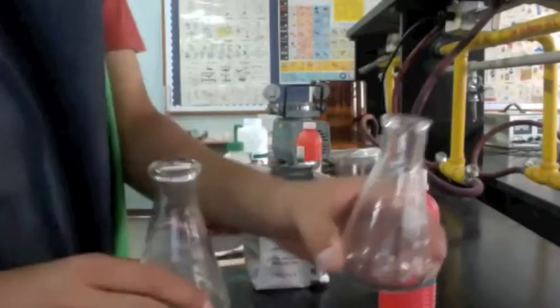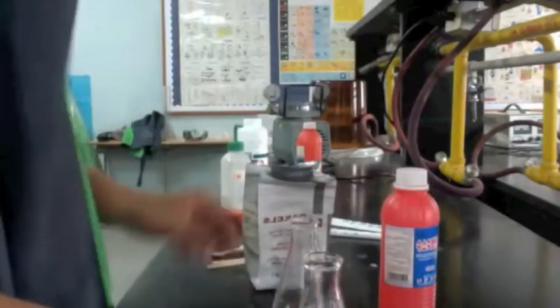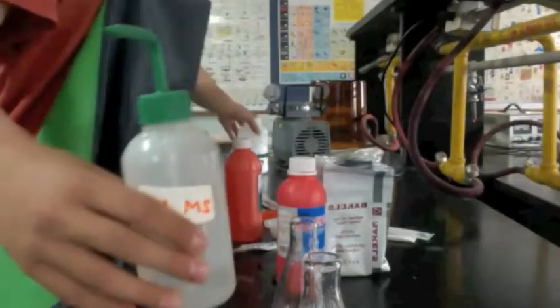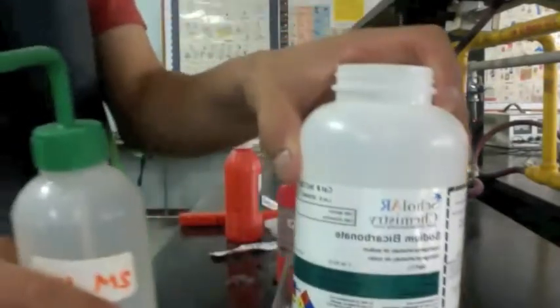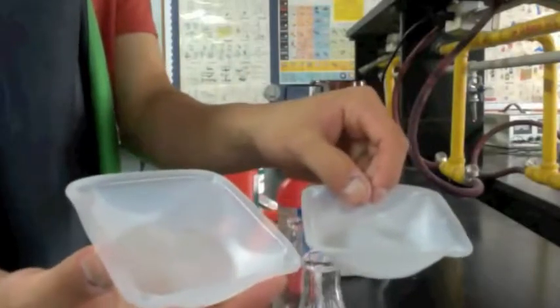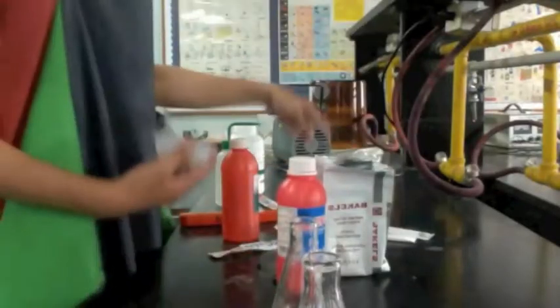Okay, so first off, we have these two flasks to produce the gases. We have these two wooden chopsticks that we're going to light on fire. We have hydrogen peroxide and dry yeast, which we will mix to produce oxygen. We also have 2 molar hydrochloric acid, which you can see now, and sodium bicarbonate, also known as baking soda, which we will mix to produce carbon dioxide. We also have these two weighing trays to weigh out the dry yeast and the sodium bicarbonate.